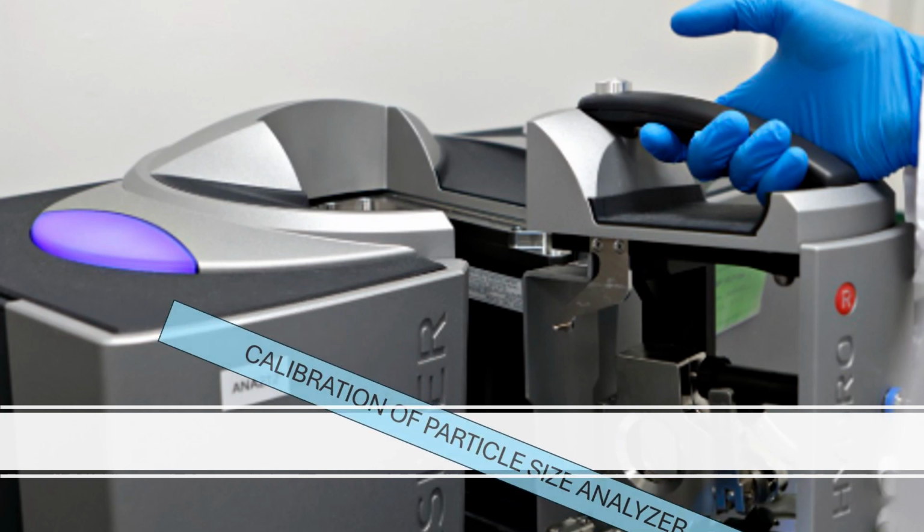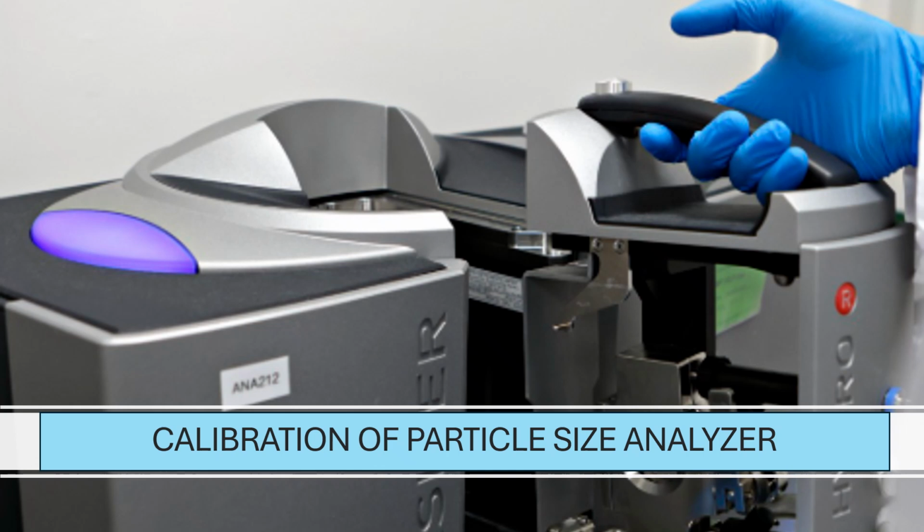So today we'll discuss the calibration procedure for the particle size analyzer. In the last video, I already explained the particle size analyzer, right? The calibration of a particle size analyzer is a critical step in ensuring that the measurements we generate are both accurate and traceable to recognized standards.